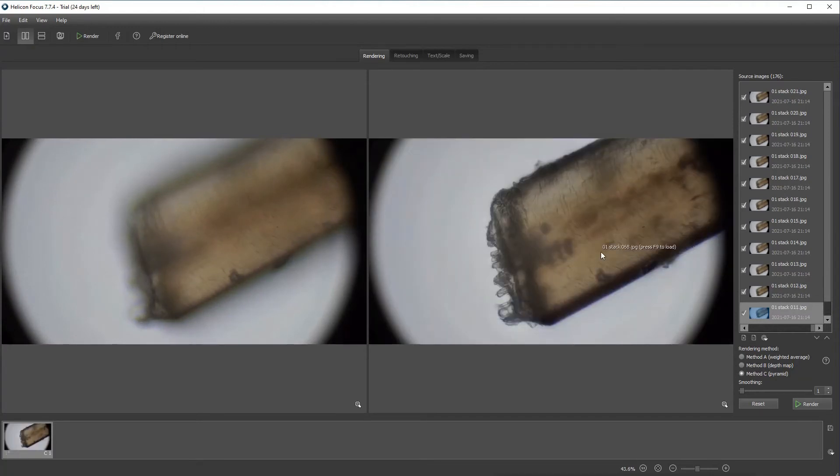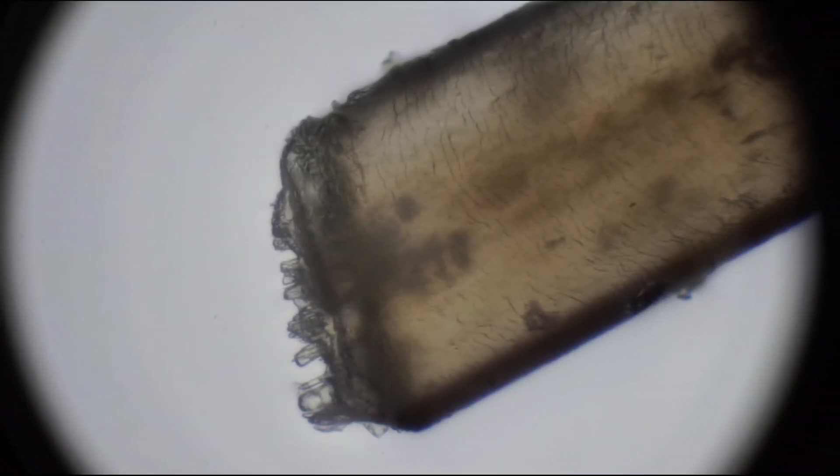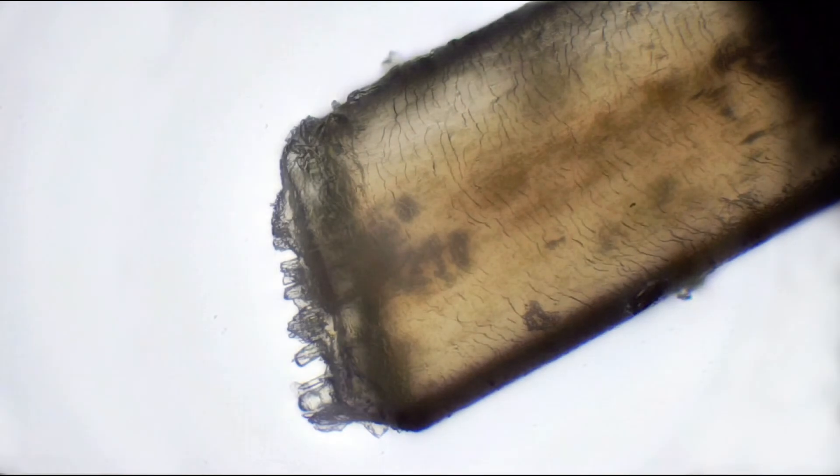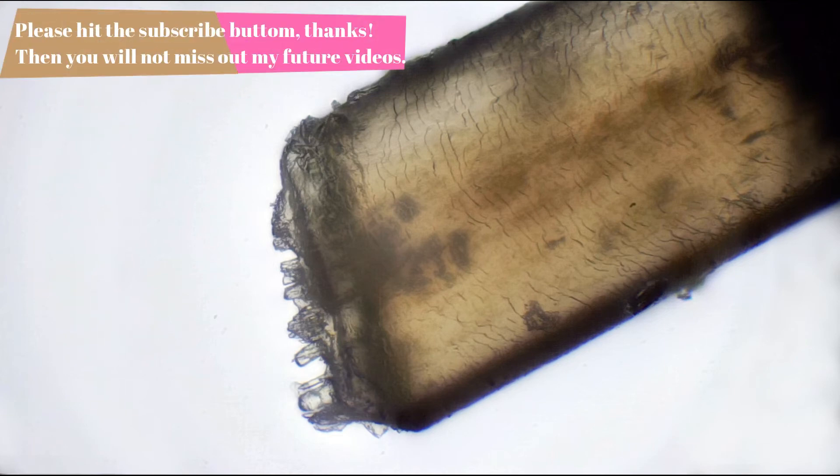Yeah here we got one. And this is one of the pictures that then become one. So I will save the picture. And here is the result. This is an exported tiff image that I choose to just quick edit in GIMP. I just use the clone stamp to remove the ring of vignette around it and also add a little more color. I change the levels a little to make it brighter and in the end I just use the unsharp mask.